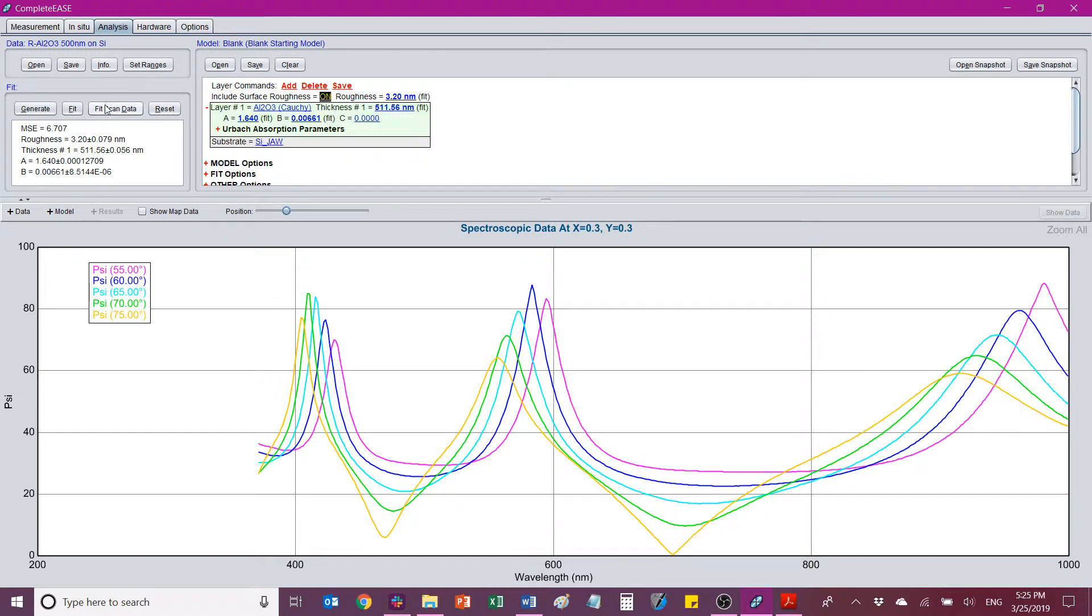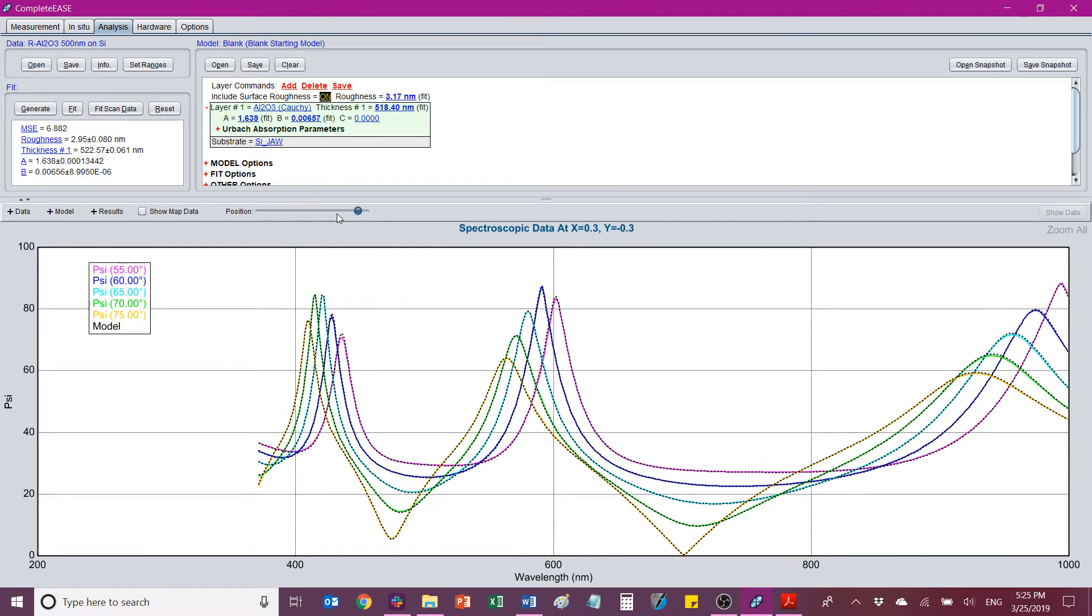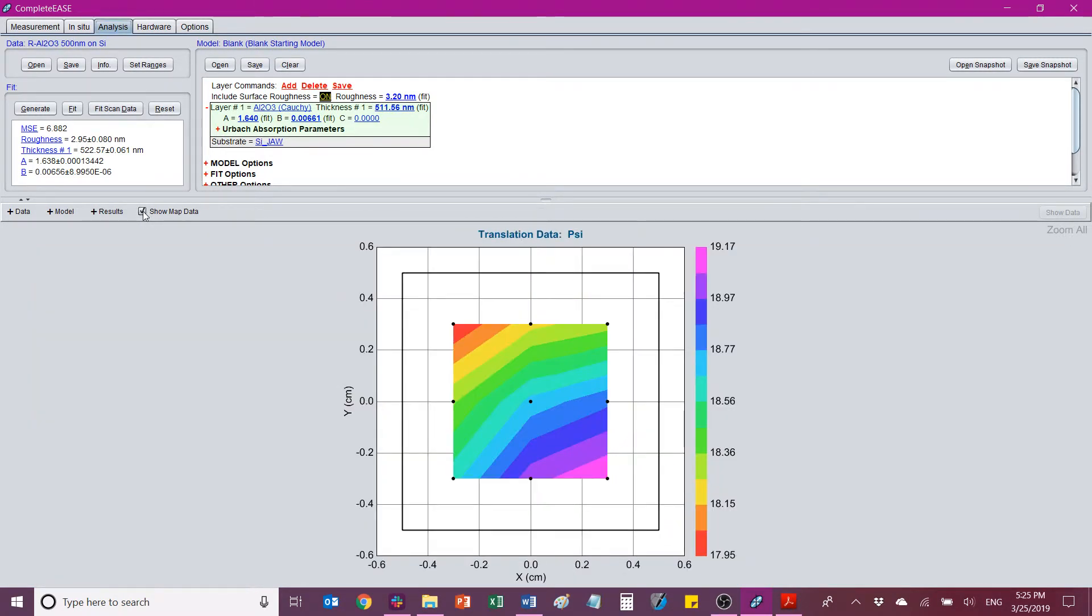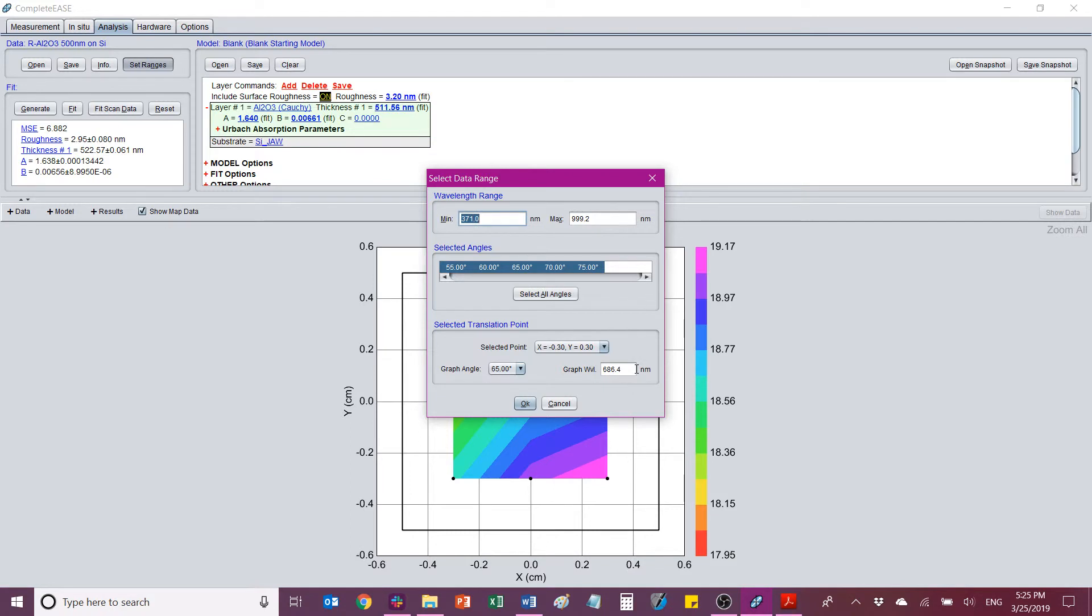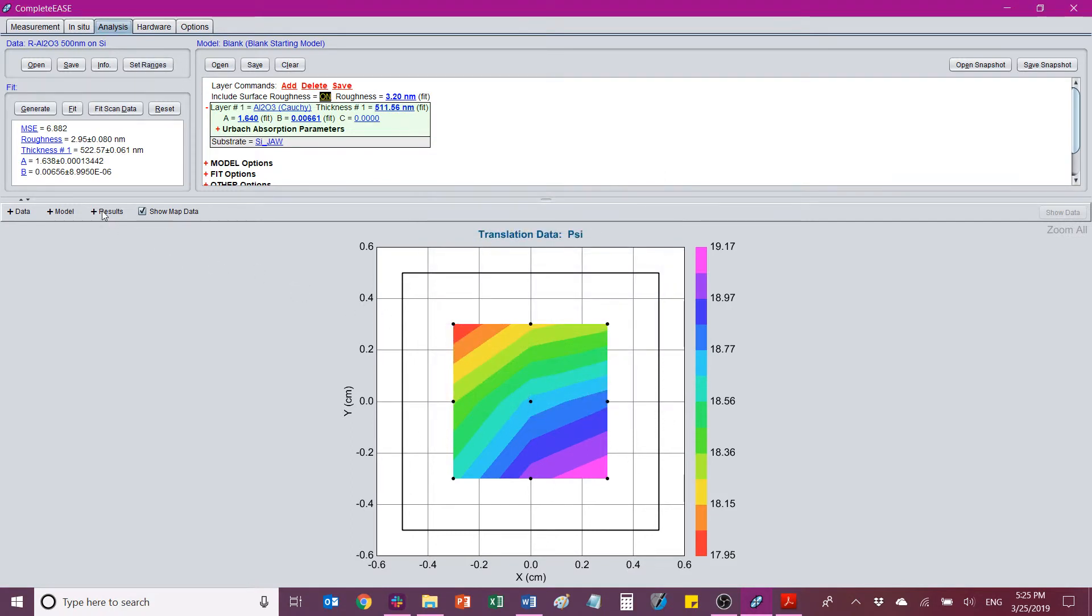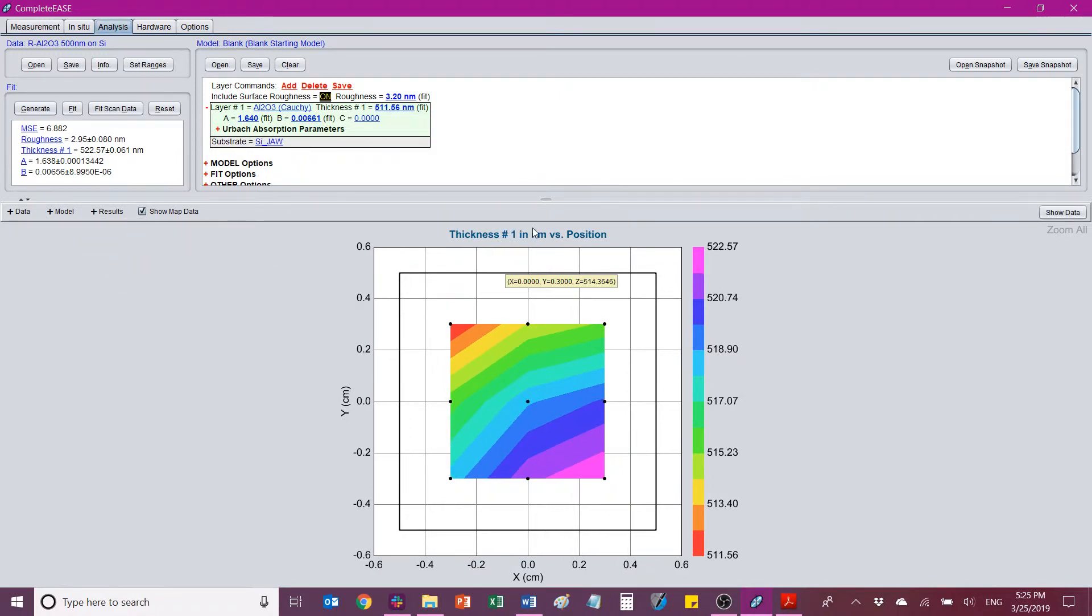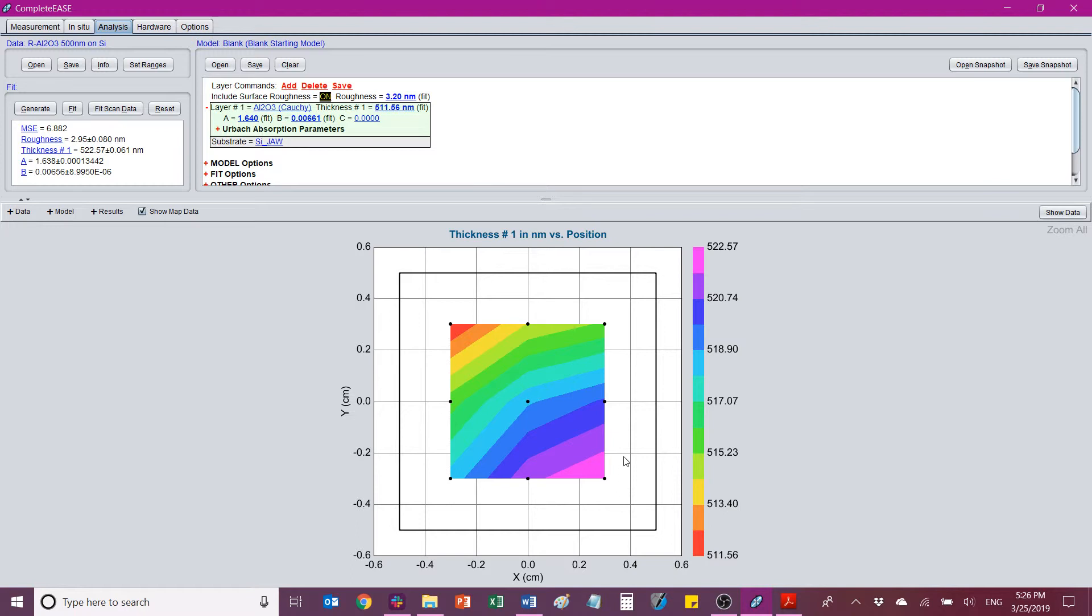Okay. Now fit scan data has made it so that the fit is applied to all of these. Now that I have that, I can click this which says show map data. And this brings me to show the psi value that was collected at every point at a specific wavelength. Which you can set by going to set ranges and then choose this graph wavelength. So what I will do is I will go to results. And anything that is being spit out here as a fit parameter will be something I can choose such as the thickness. And now I'm looking at a contour map of the thickness across the area of this square centimeter size chip. And it ranges from 522 to about 511 in a direction from corner to corner diagonally.